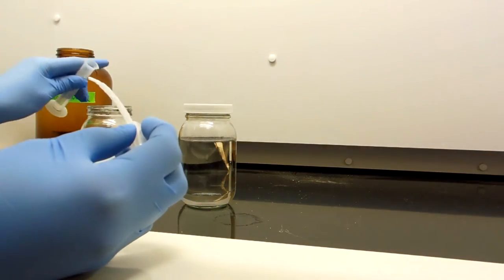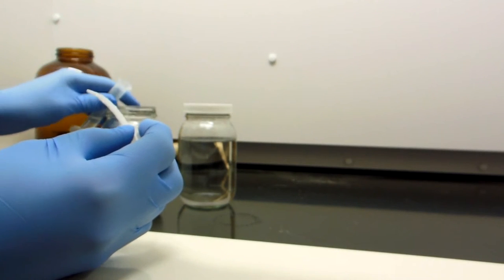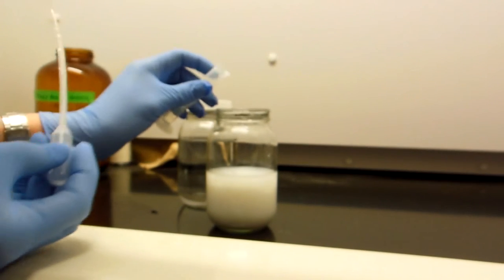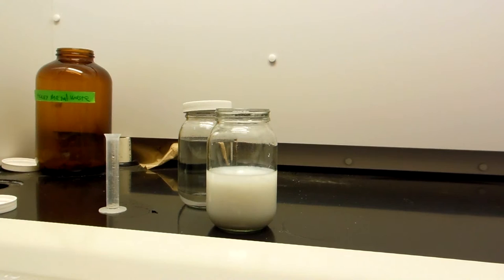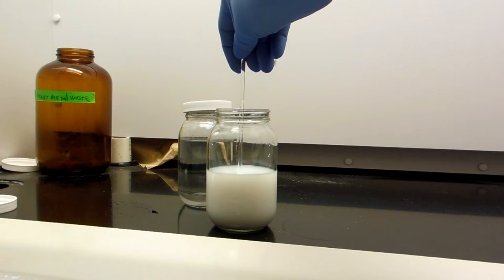So I just go ahead and just pour the entire remainder of the graduated cylinder into the acid solution, which contains silver. And so now, after adding that extra sodium chloride in the aqueous solution, I then just stir the mixture.